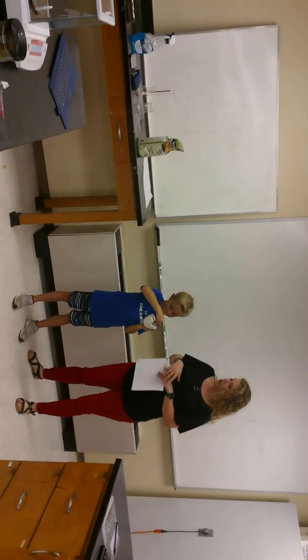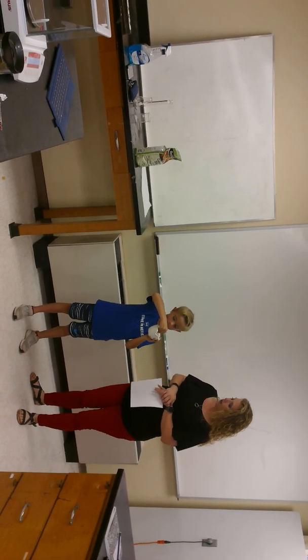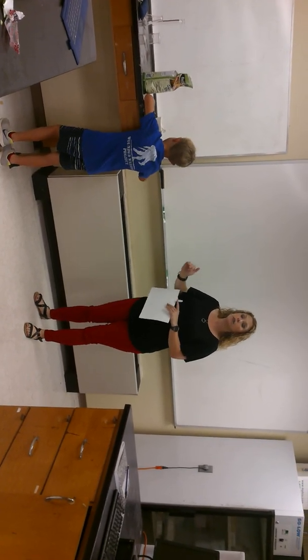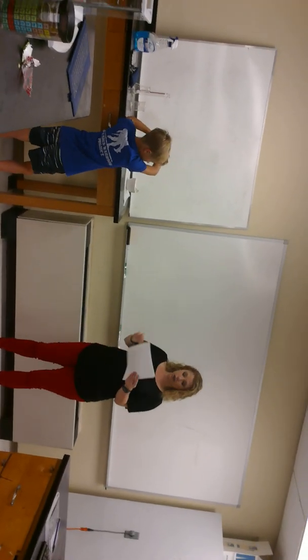But you use the pestle to do what? Grind. And you're showing us very well right there how to do that. We put our fertilizer in there and we grind it up. Now, all right, you can let that down there. Now, the thing about it is you're not going to be able to get every bit out of there. So just kind of pour some fertilizer in there, grind it up, then get the gram out of that. Don't get a gram and put it there because you're not going to have a gram out.